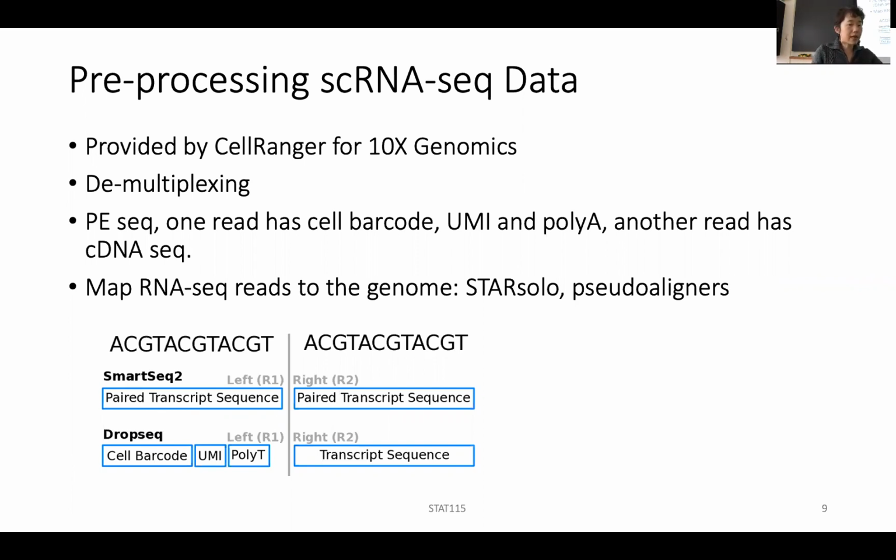There is a barcode at the end because for each cell you make a library, and right before you put them for sequencing, you add a little bit of a barcode just to say, this is my cell 1, this is my cell 2. This is no different from multiplexing 10 or 50 RNA samples into the same sequencing lane. You can use standard RNA-seq methods to separate out the barcode afterwards.